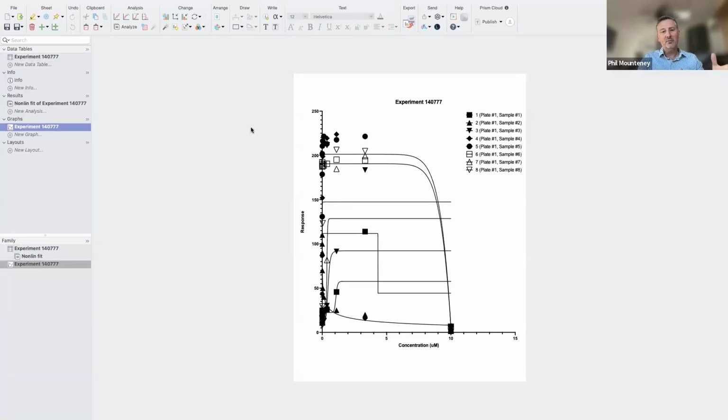So we've already smoothed out one of the challenges of getting data into Prism from the notebook, and that's by natively writing the Prism file. But how can we get this Prism data back into a dashboard in a seamless way? And this is another pattern that you'll see with Luma. We have, in many of the Dotmatics tools, a send to Luma button.